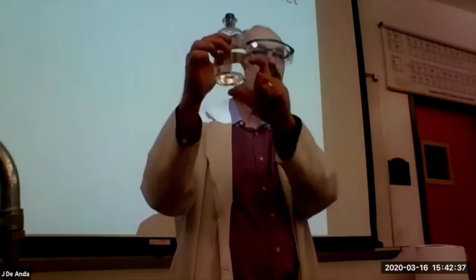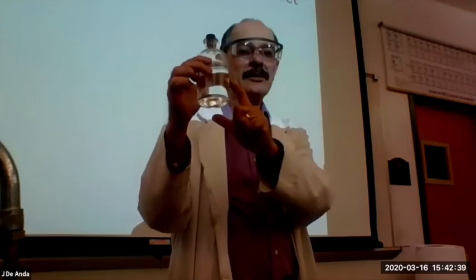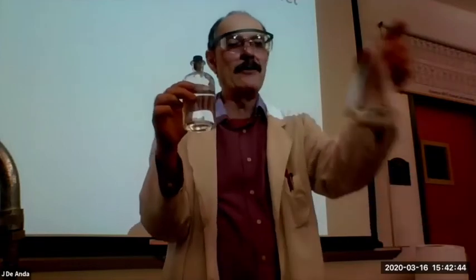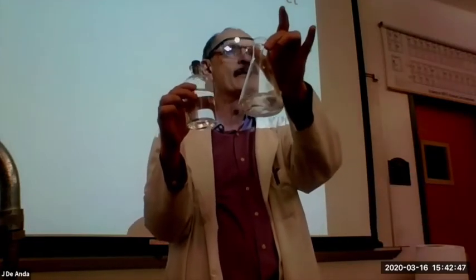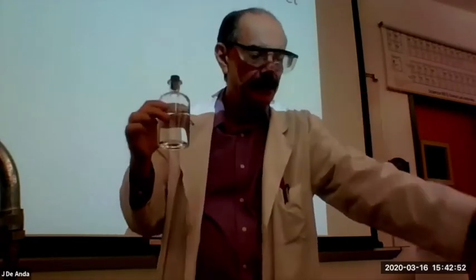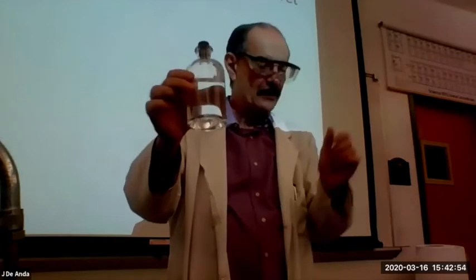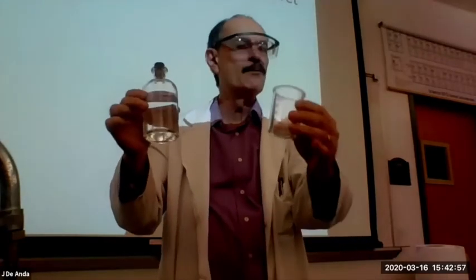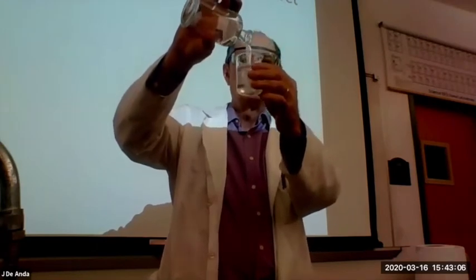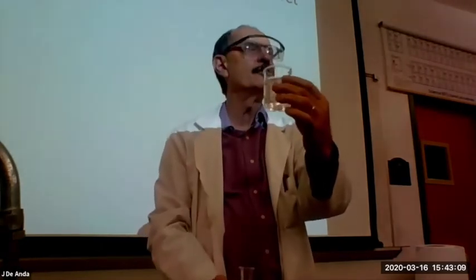So we're going to use this as our titrant on the burette and react it with our mixture of acid, which we know exactly how many moles are in there, to find out how many moles are in a sample of this. Now, it's hard to pour from here, so I would suggest you grab a small beaker and put some of this in there. Maybe like 100 milliliters of this. The reason being that with the beaker spout, you can pour more easily from it, all right?